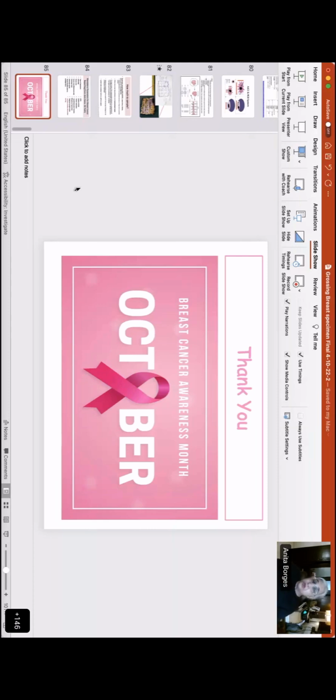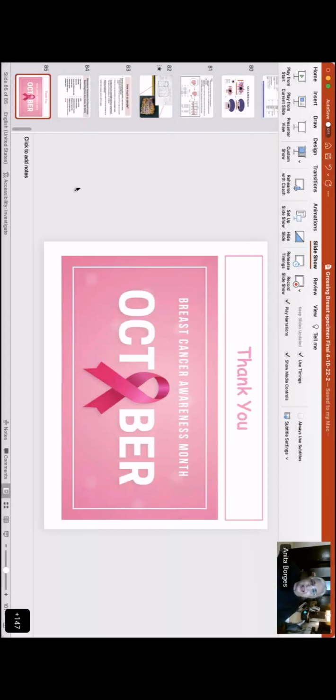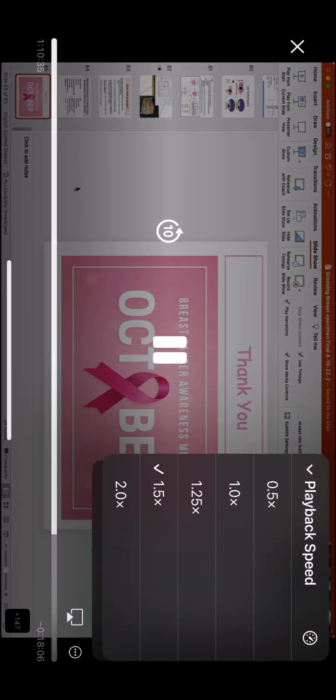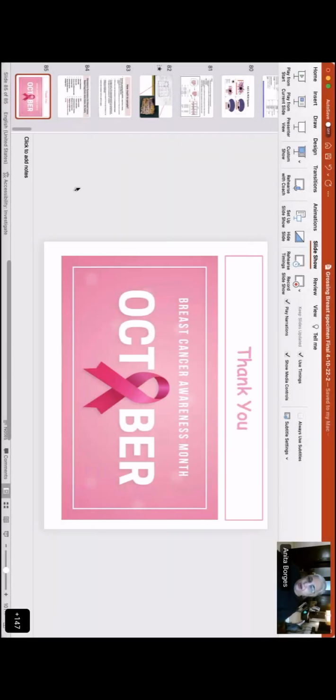And this is also very useful when you're trying to dissect lymph nodes in the axilla. When you've got axillary fat and you're dissecting lymph nodes, if you see veins or vessels going there, just feel along the vasculature, and you will find lymph nodes. If you lay that fat out like a screen and look for the vessels, you are going to be much more successful at finding these, because that's where the lymph nodes and the lymphatics go. They go along the vascular bundles.